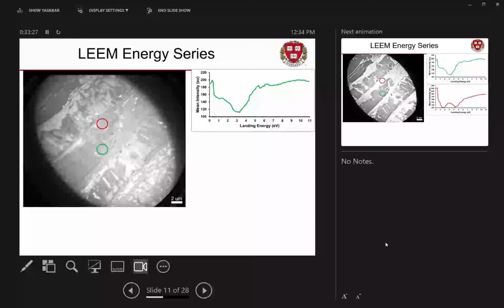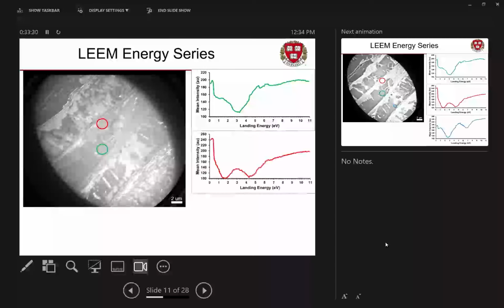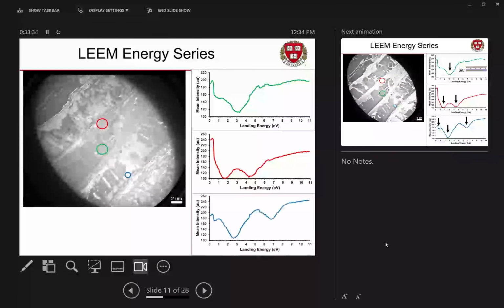Okay, so what? Well, how about over here? Over here, we got 2 dips. How about that spot? 3 dips, although this one's not very much of a dip, but it counts. So what would all these dips mean? Everywhere there's a dip, it means that at that particular depth into the sample, there were empty states that an electron could get absorbed into.